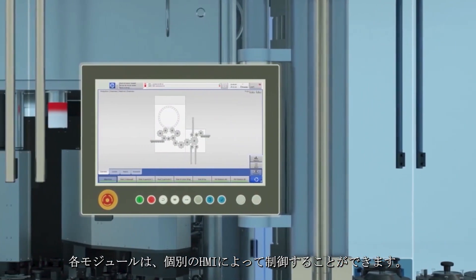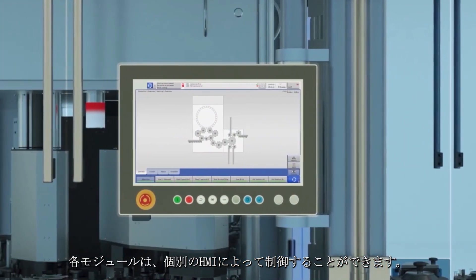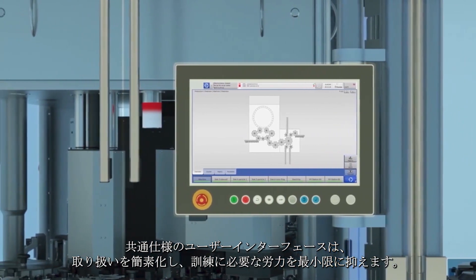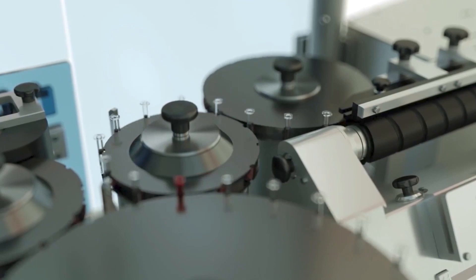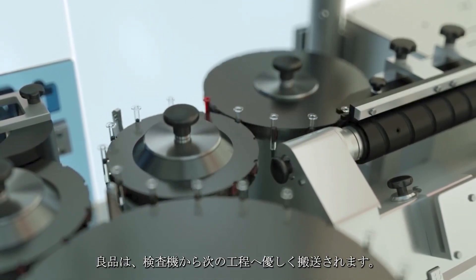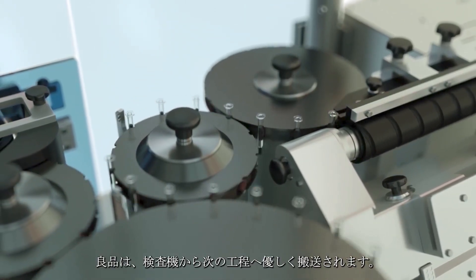Every module can be controlled via an individual HMI. The use of identical user interfaces simplifies handling and minimizes training effort. Good products are gently transferred from the inspection machine to the next step.